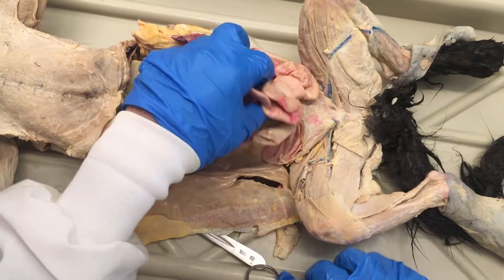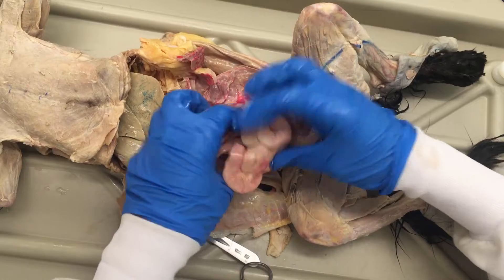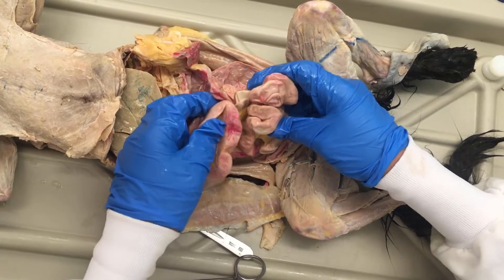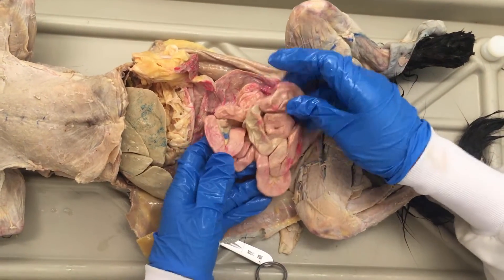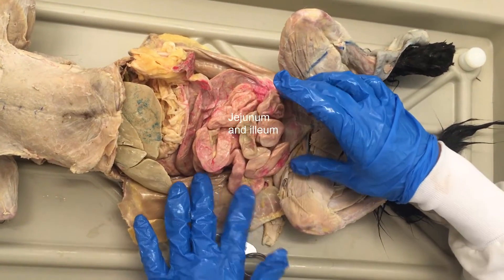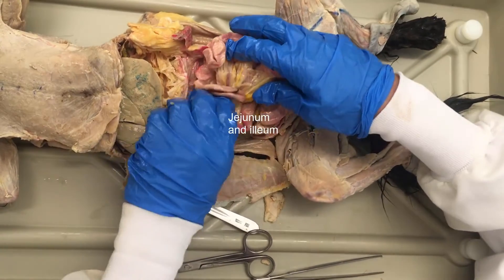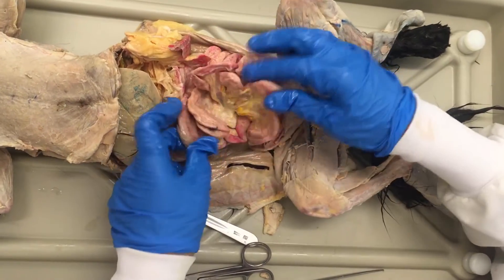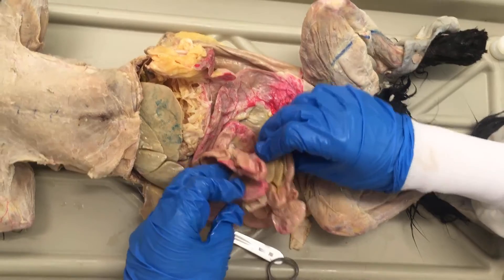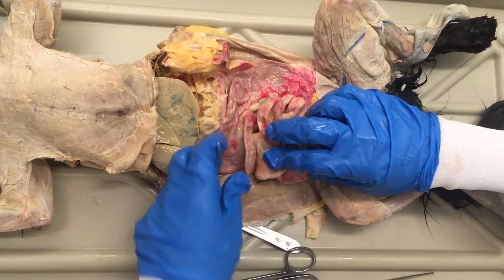Moving further along the GI tract, we've got the duodenum, and then it starts to come into this portion of the small intestine where it's all zigzaggy. Anatomically you really can't tell the difference between the last two regions of the small intestine. There's the jejunum and then there's the ileum. Jejunum makes up quite a lot of the length of the small intestine; the duodenum is the least amount of distance. There are pretty much even amounts of jejunum and ileum. The differences are histological, so you really can't tell anatomically where these differences are.